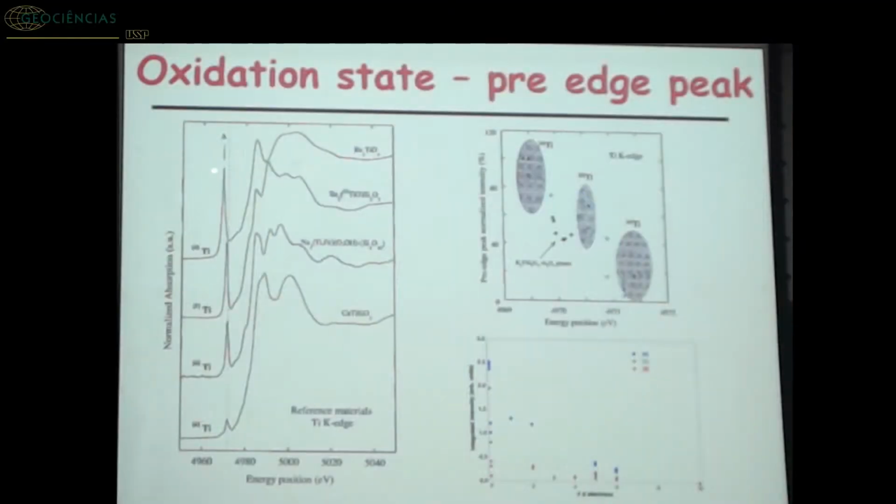If we go to titanium on the left-hand side of the transition element row, we get pre-peak as low as this, up to almost as high as the edge jump. Why? Because being a 1s to 3d electronic transition, the emptier the 3d shell, the more pronounced the transition. Here I plotted the integrated area of many pre-edge peaks according to the number of electrons.